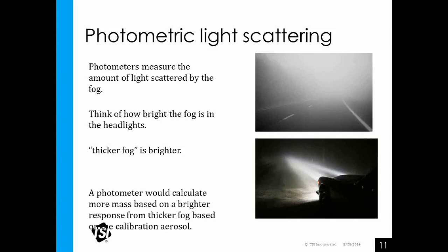And we compare that to a known size. So the instrument has been calibrated to a test aerosol, and I had a hard time getting my head around this until I explained to someone, well, it'd be like different sized balls.